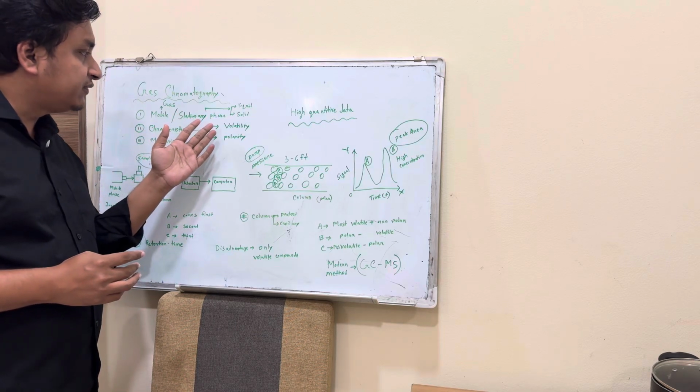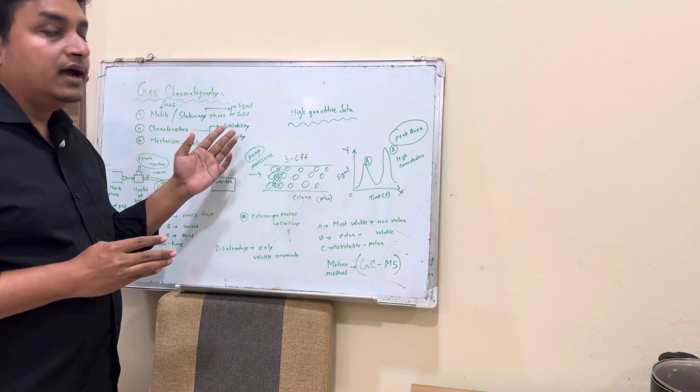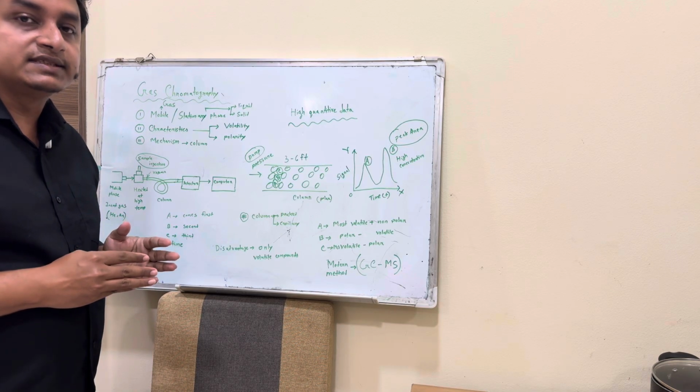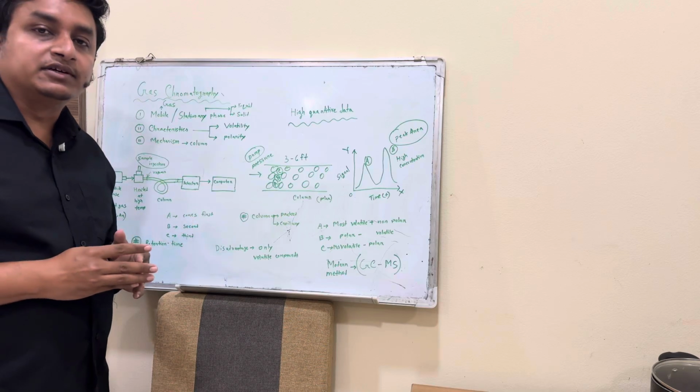In the stationary phase, it can be of two types, liquid or solid. So basically, if we classify this chromatographic process, it can be gas liquid chromatography or gas solid chromatography.